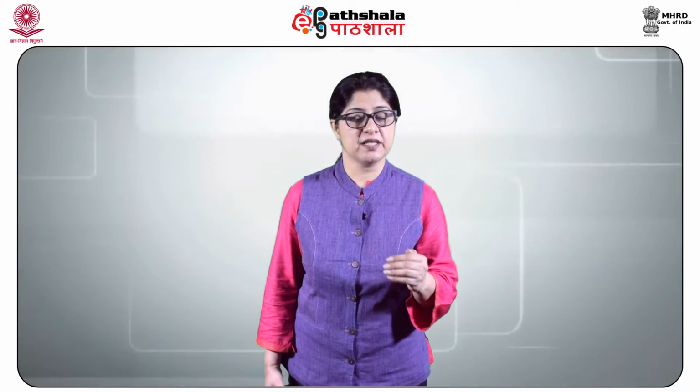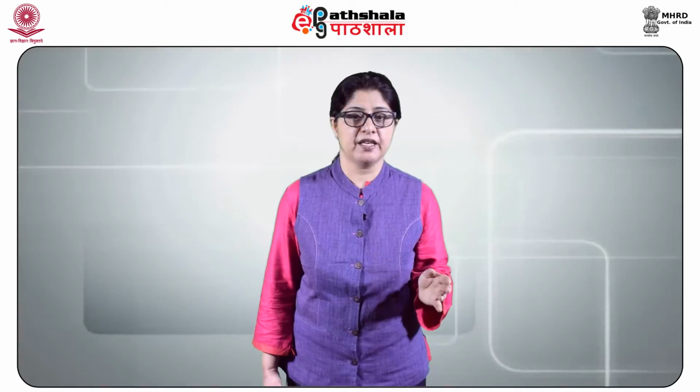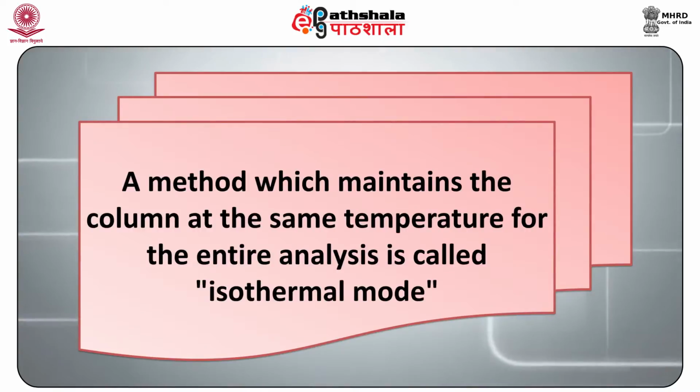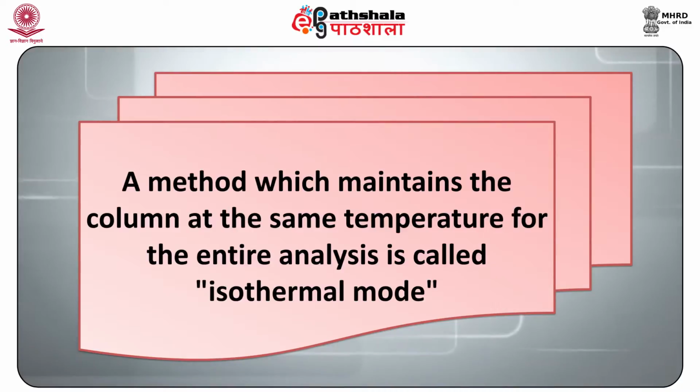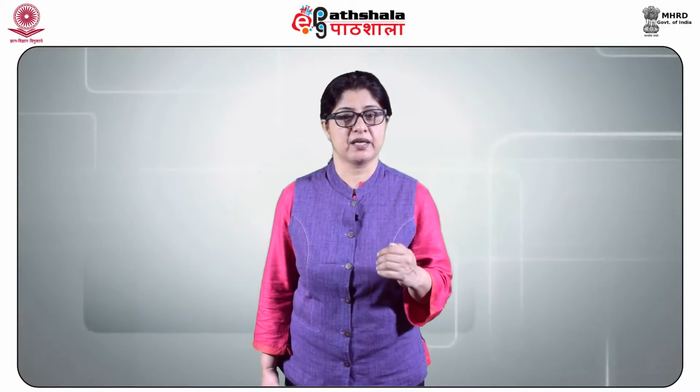However, the faster the sample moves through the column, the less it interacts with the stationary phase, leading to incomplete separation of the analytes. A method which maintains the column at the same temperature for the entire analysis is called the isothermal mode. Most methods, however, increase the column temperature at a certain rate during the analysis.